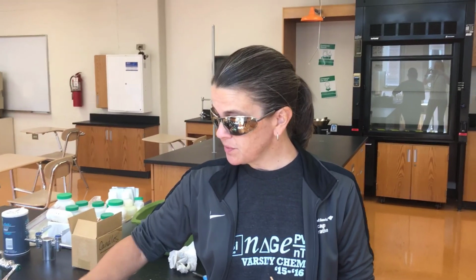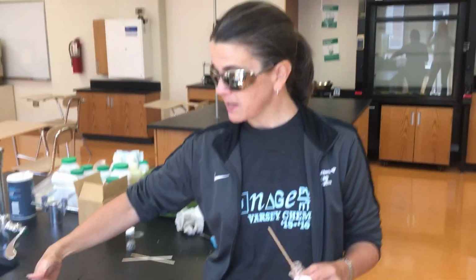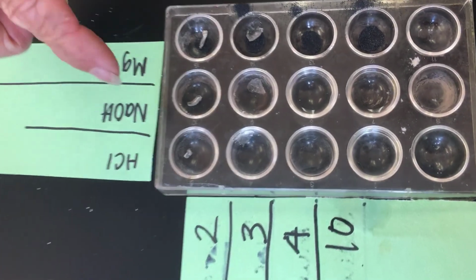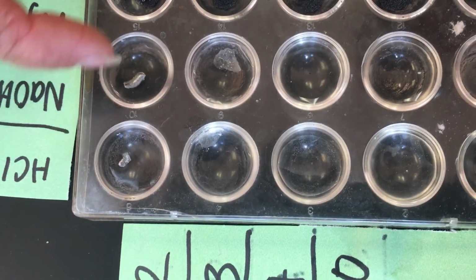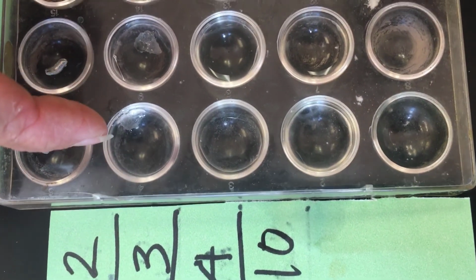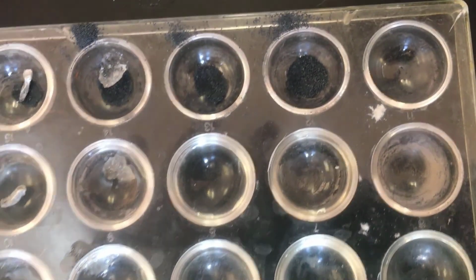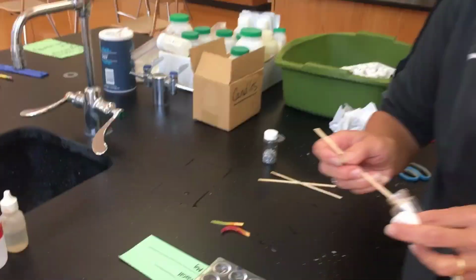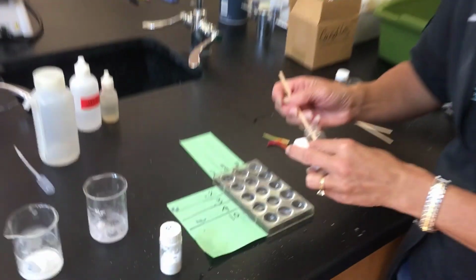Okay, now on to the reactivity test. Like before, we've set up samples 2, 3, 4, 10, and then across the top, the HCl, NaOH, and magnesium. Now, I've already gone ahead for time's sake and put sample 2 in all 3 of our test substances. And I've put sample 3 in all 3 of our test substances. I didn't see a lot happening, but let's go ahead and add sample 4. We'll do this one together.